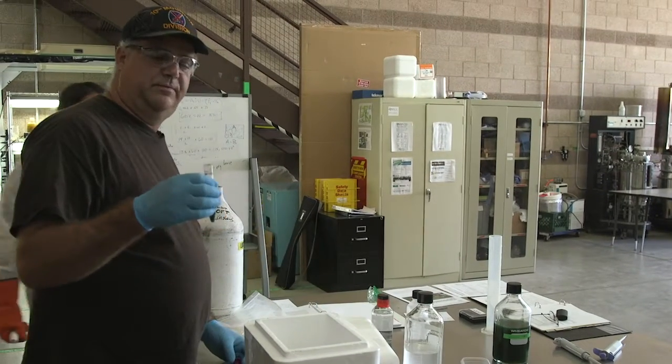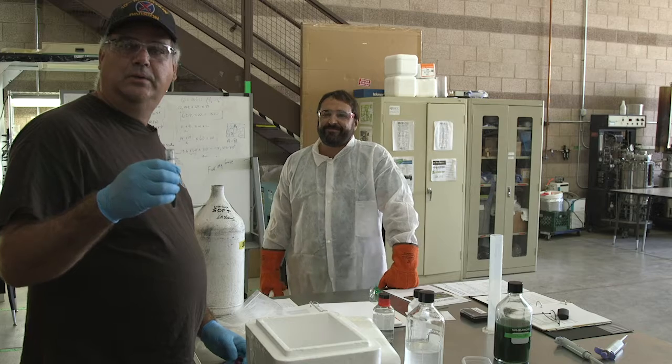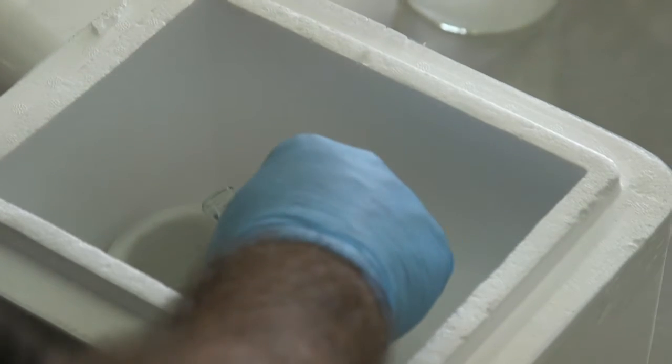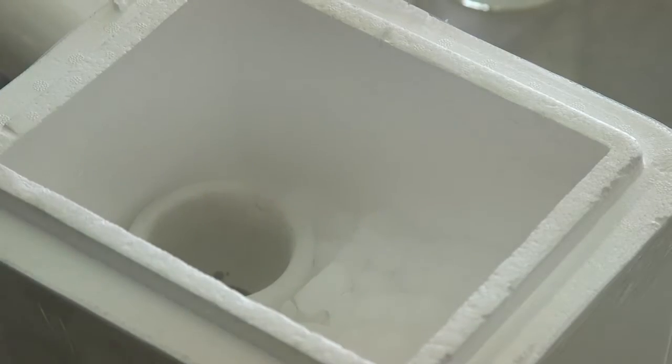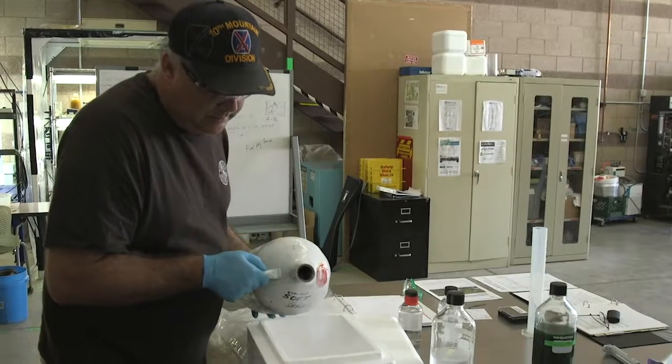We're going to take this sample and freeze it so we can grind it in the mortar and pestle. This will break open all the cell walls so we can get what's inside the cyanobacteria out from the algae. In order to freeze it, this is sitting in dry ice right now, and then I'm going to pour some liquid nitrogen on it — add the liquid nitrogen slowly to freeze it.